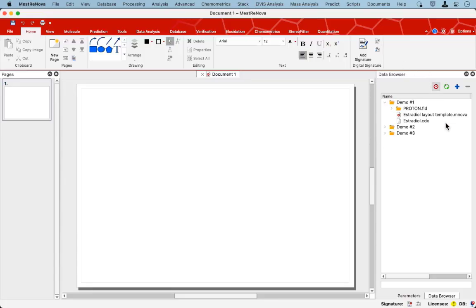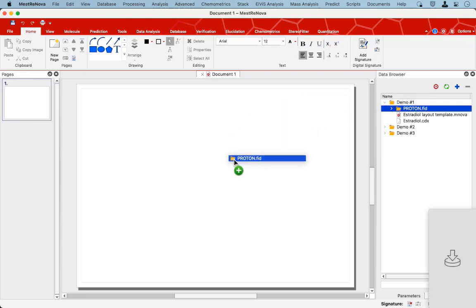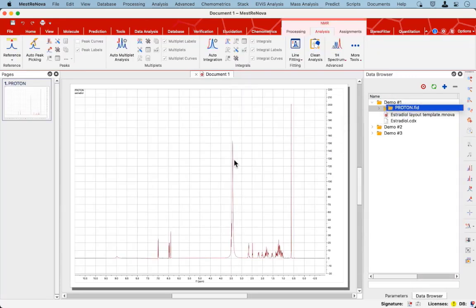So as you can see from my data browser over here, I have a directory with some raw data. Let me drag and drop that onto the canvas.